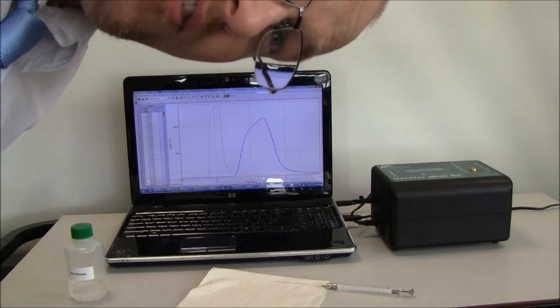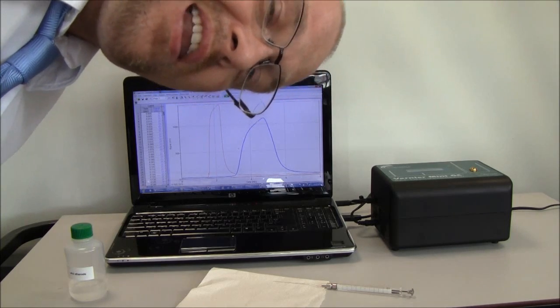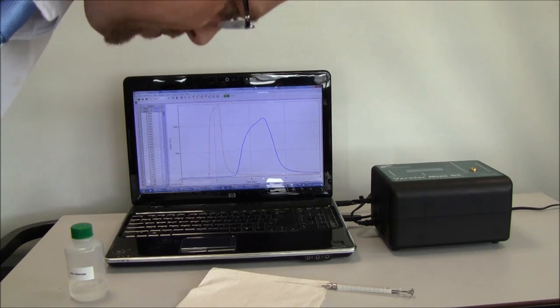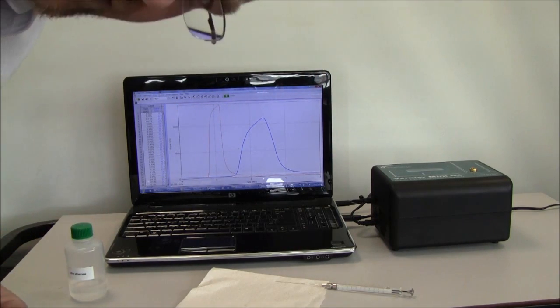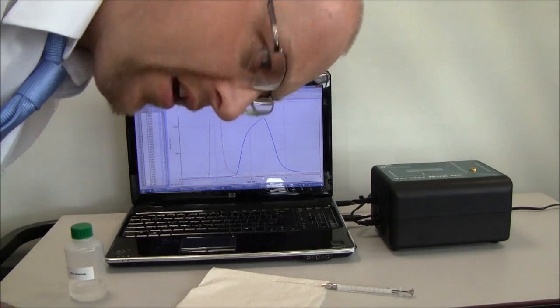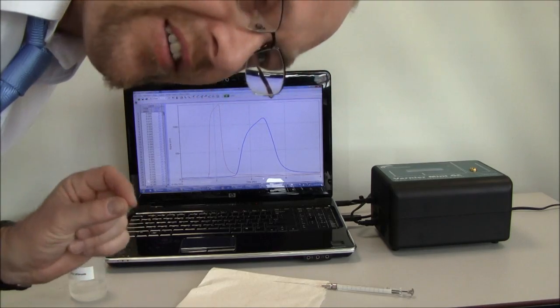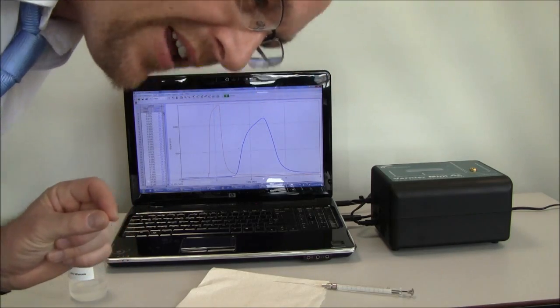Okay, for the third sample we're going to use ethyl ethanoate. Again I'm going to clean the syringe out and then inject a teeny tiny amount in.